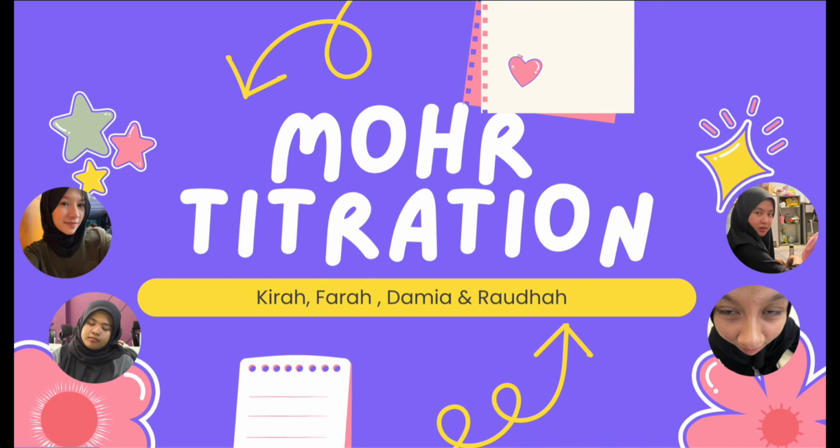So our group members are Kira, Damia, Farah and Rauda. We are going to talk about the working principle, application in the food industry, and the procedure of Mohr titration.